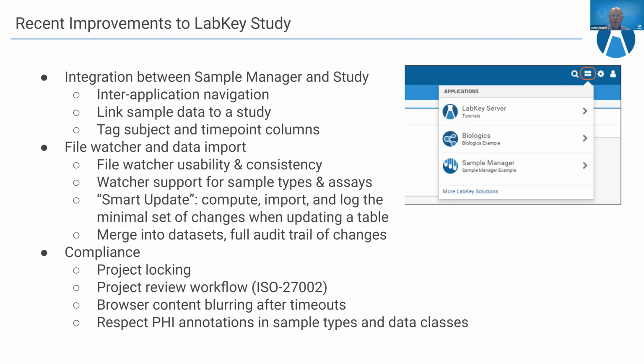We've also created this year what we call Smart Update. Basically, when LabKey is being used to import data from, say, a database where that database is the system of record, oftentimes we will load all that data from that system into LabKey, often on a nightly basis or on a very regular basis, so that the data is always up to date within LabKey. Most of these systems export just a single archive that represents, say, 12 years of data.